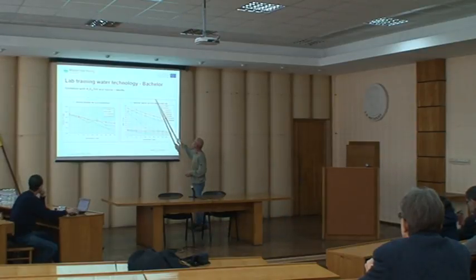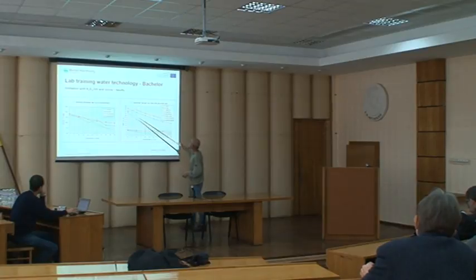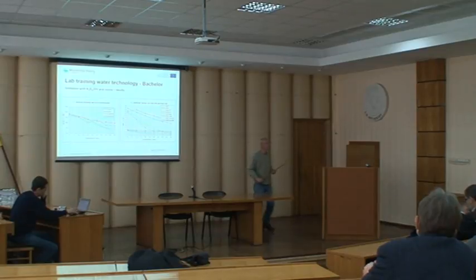And here we got the SAC 254 and 436 over the reaction time. I have to find out, I guess this is the 254. So over the reaction time, we can record a decrease of the sum parameter for organic substances over the time.